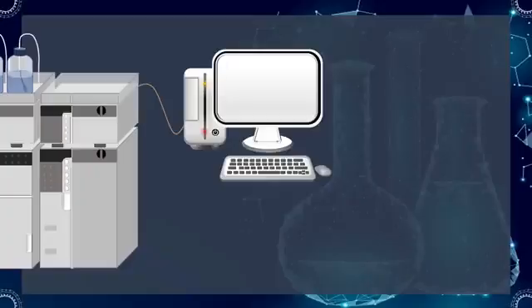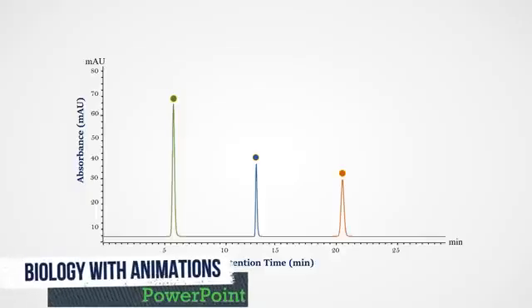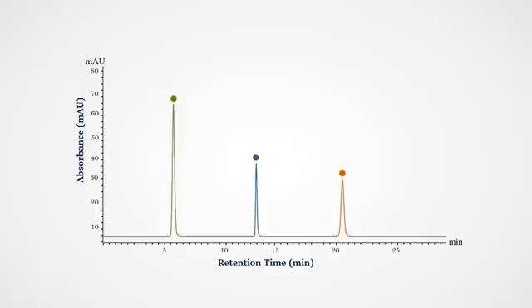The number of peaks present can indicate how many components are in the mixture. Usually, the x-axis of the HPLC chromatogram shows the amount of time taken for the analytes to pass through the column and reach the detector. Typically, the y-axis, or the area of the peak, is a reflection of the amount of a specific analyte that's present.